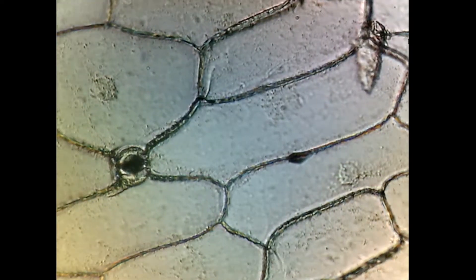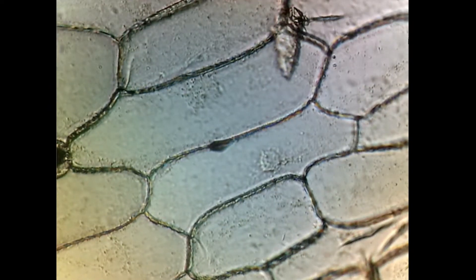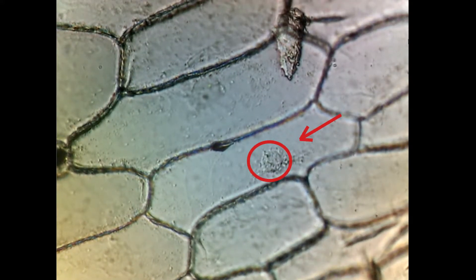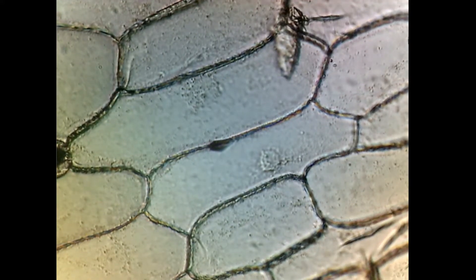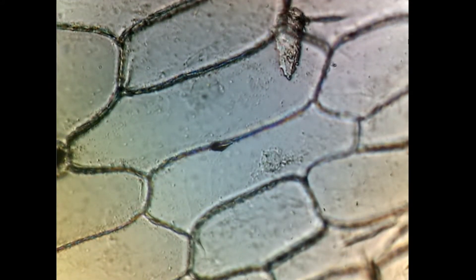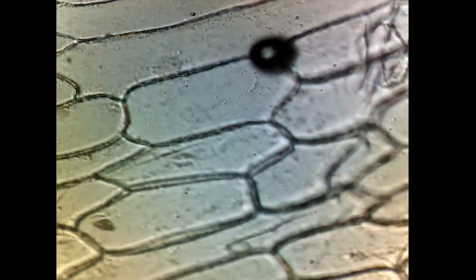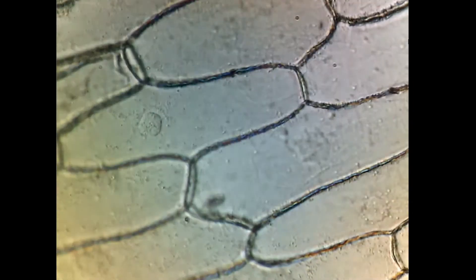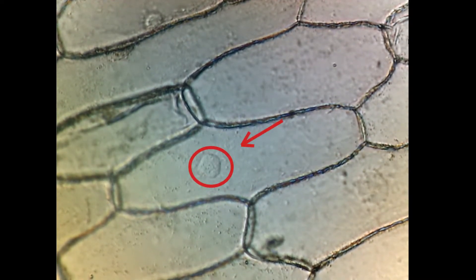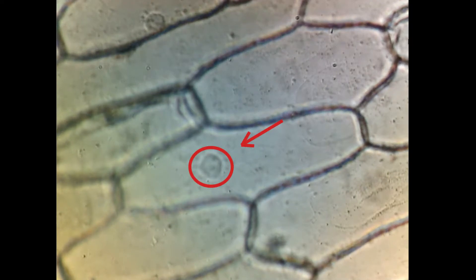Here you can see the individual cells. Nucleus. Here you can clearly see the nucleus of the onion cell.